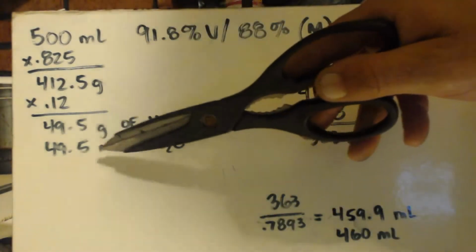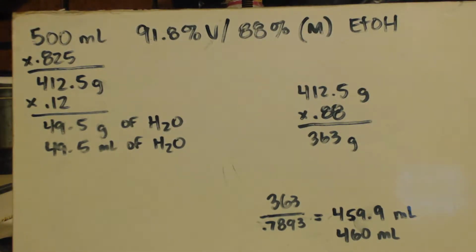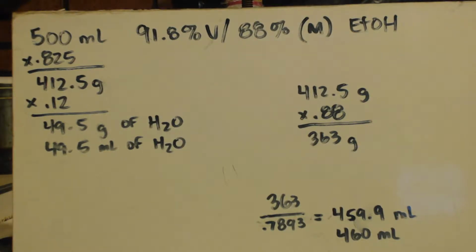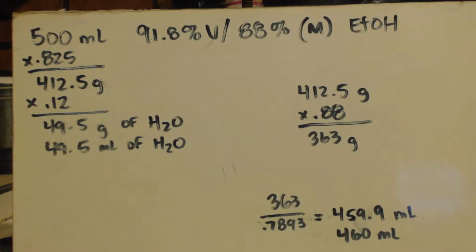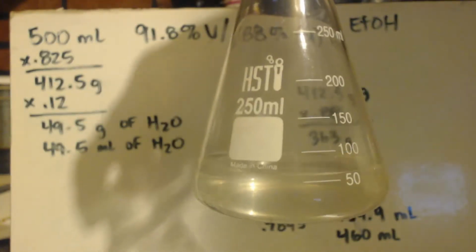And there's also 50 milliliters of water in this 500 milliliters mixture. Now, if you add up 460 and 50, you end up with 510 milliliters total, right? But when you mix them together, that 510 condenses down to 500. That's why you can't do the math with volume. Anyways, my whole point is that there was almost 50 milliliters of water in this pot when we started out, and I ended up with 60 milliliters in the pot, okay?